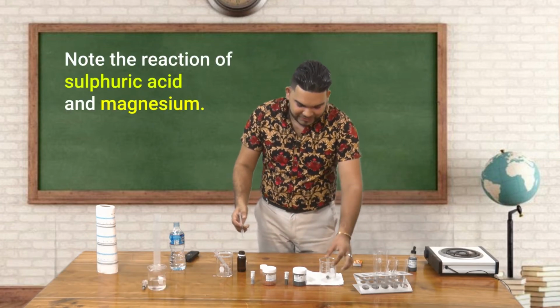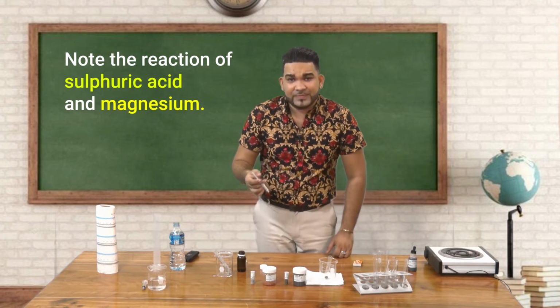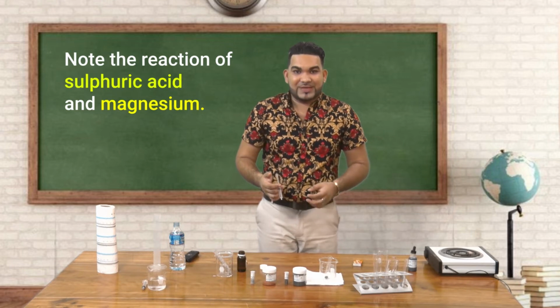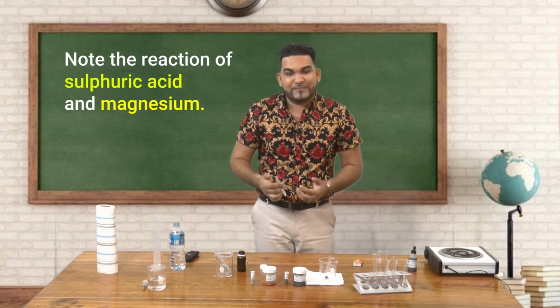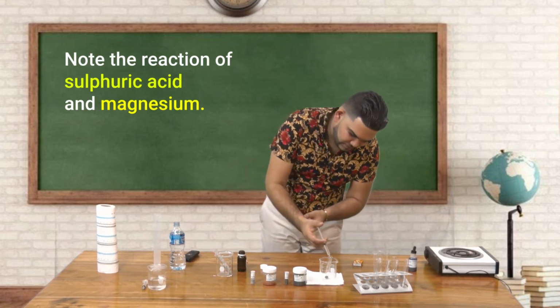So I have here, as I have mentioned, my magnesium, and now I'm going to drop a few drops of sulfuric acid. So pay attention. Please note what you're looking at is how vigorous or how slow or if none at all reaction will occur. So let us go.